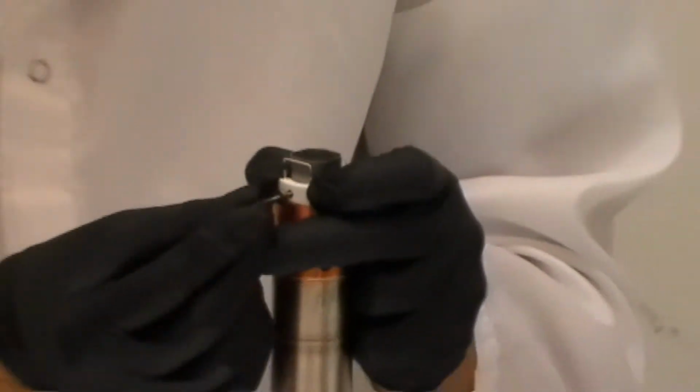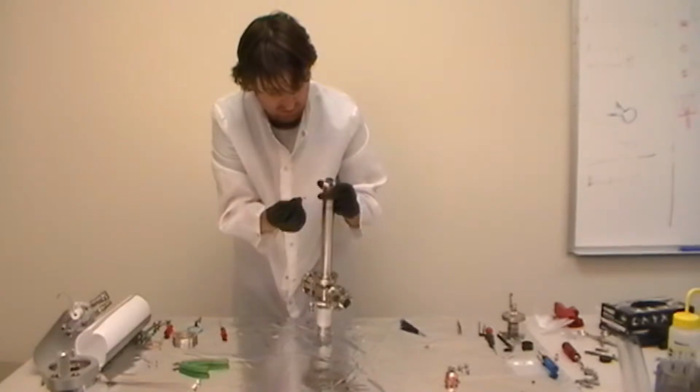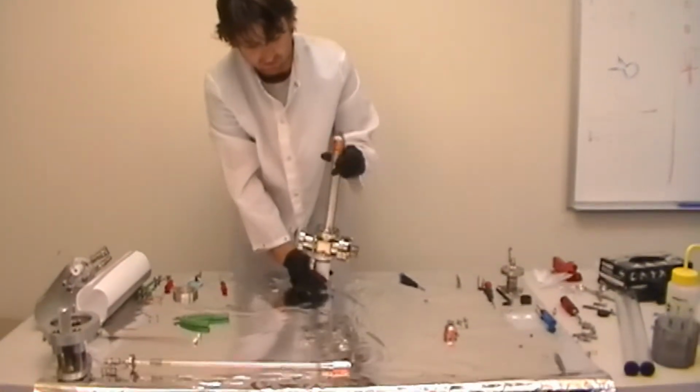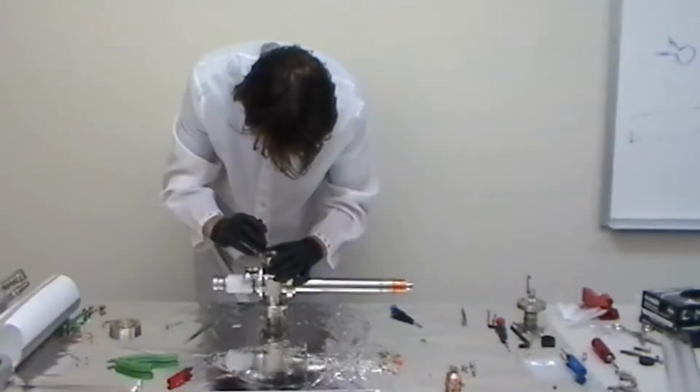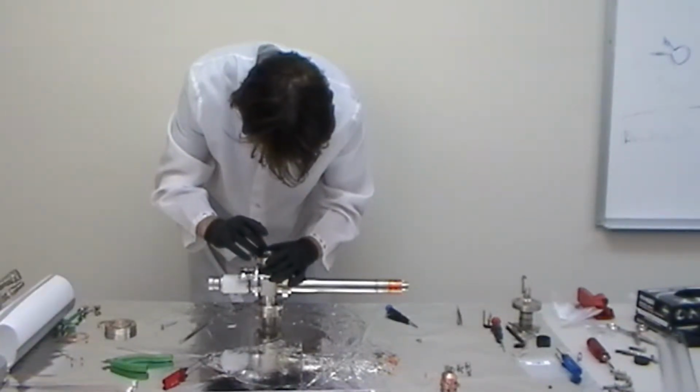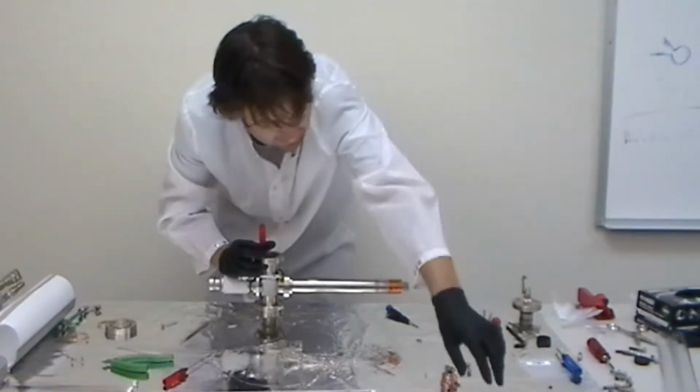So you push that down a little bit. The pin pushes in, and then you unscrew it. Unscrew the OT 80 screw. And now what you have is you've got the filament installed and the wires are pushing on the back of those couplers. So you want to go in there and you want to hold a needle nose pliers on the coupler while you use your 0448-4 Bristol tool to tighten the set screw.